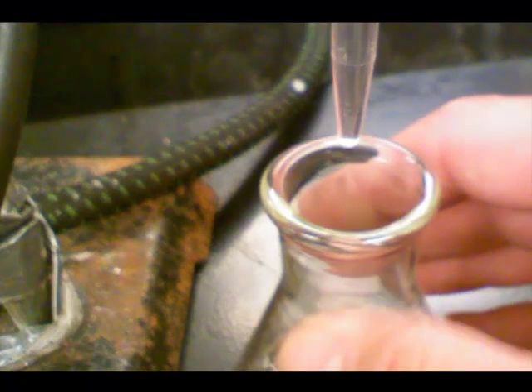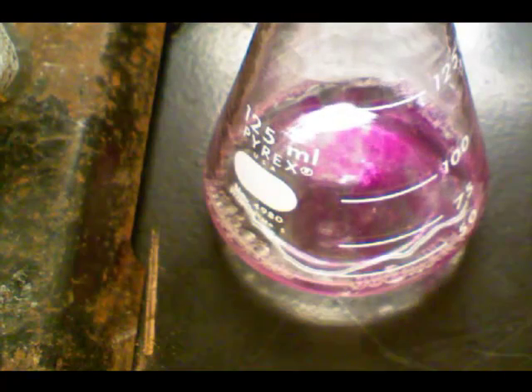I'm almost ready to begin titrating, but I have to remember to put my indicator in there because if I don't, the whole thing's going to look colorless the whole time and I'll miss my endpoint. So I'm selecting an indicator called phenolphthalein. It looks pink, as I said, when basic solution. I just added a couple of drops, I swirl them around, and now my solution looks pink.